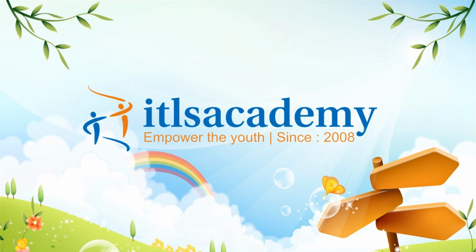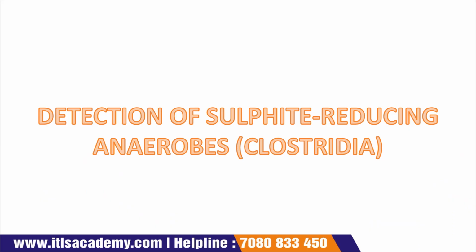Today we are going to discuss the detection of sulfite reducing anaerobe, that is Clostridia. Okay, we all know that Clostridia is a microorganism, a bacteria.